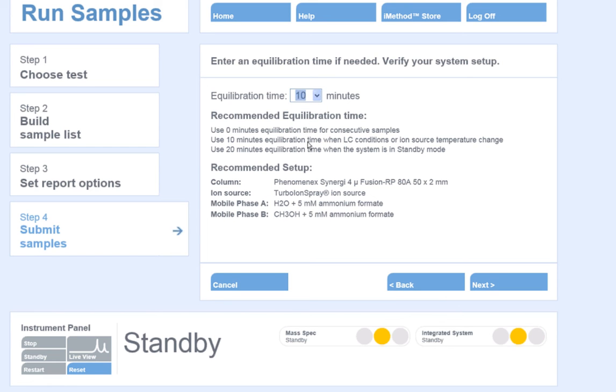Also on this screen, you will see a reminder for your analyst as to what column should be installed on the HPLC, and what mobile phases are required for this application.